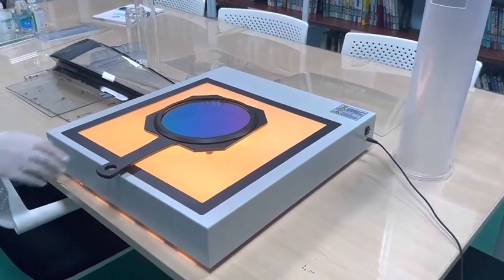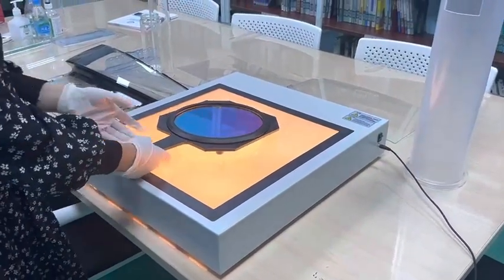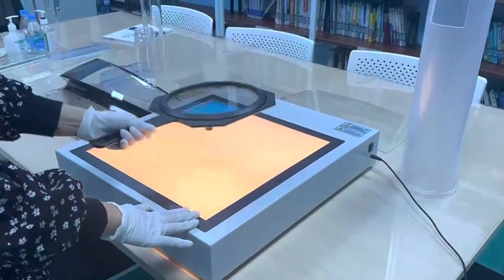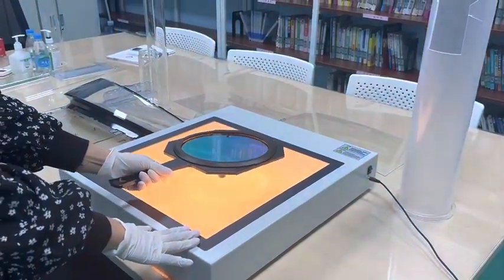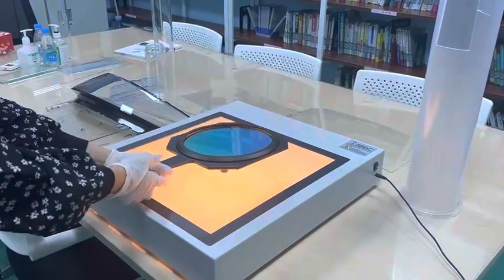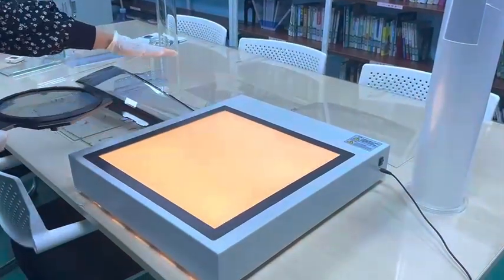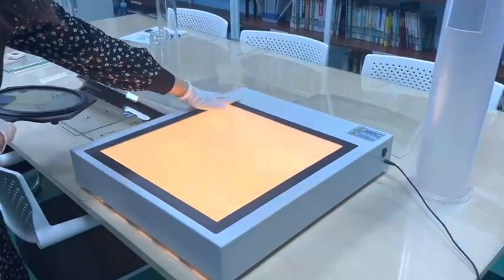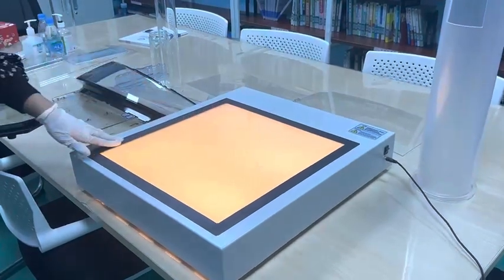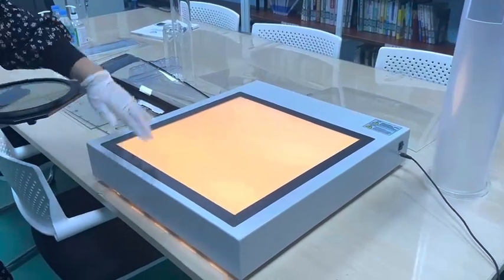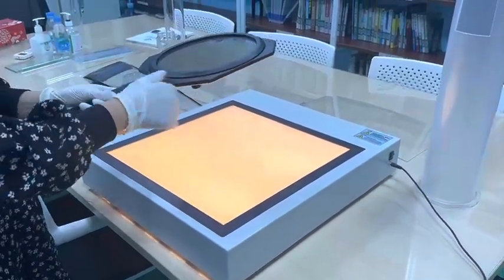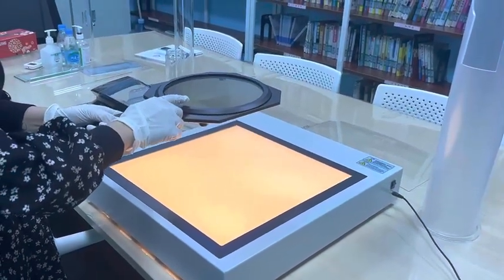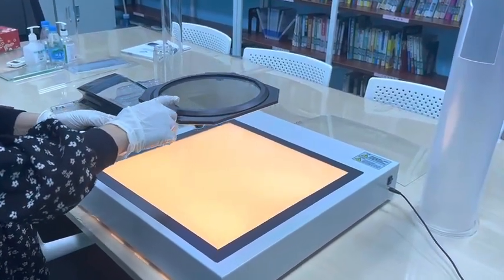We can see it's made of two parts and the size is huge. This is a polarizer 40 centimeter by 40 centimeter, and the analyzer has a diameter of 200 mm.